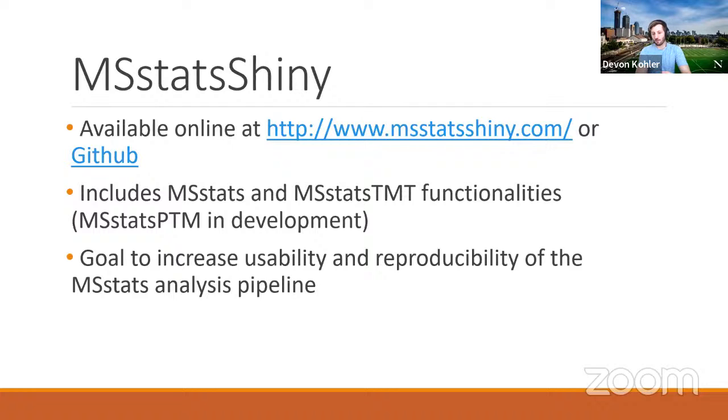Next, I'll go over MSstats Shiny, which we obviously did a lot of work with yesterday, but just to give you an idea of the reason it was developed and when you might actually use it versus some of the code functionalities, and when it might be appropriate.